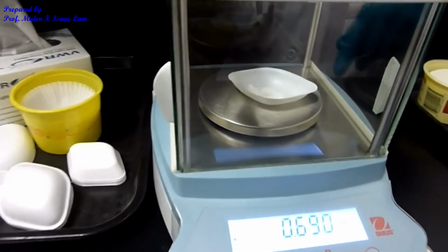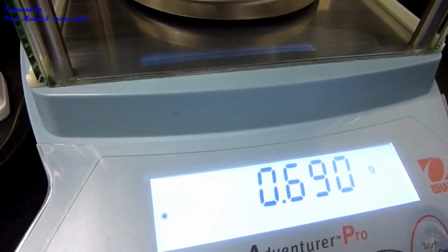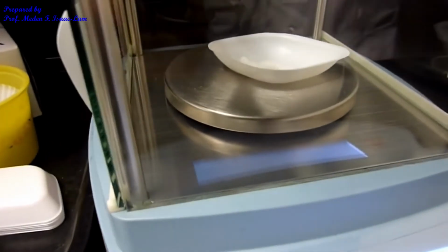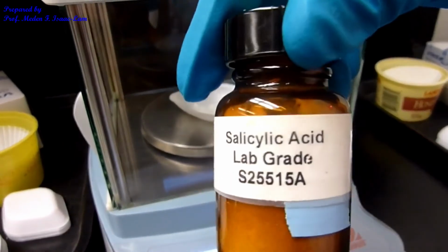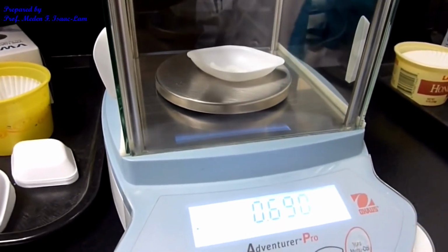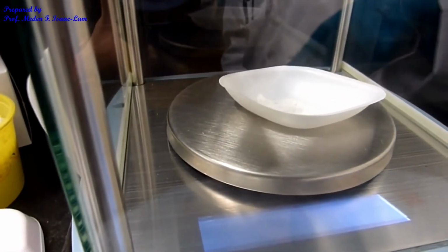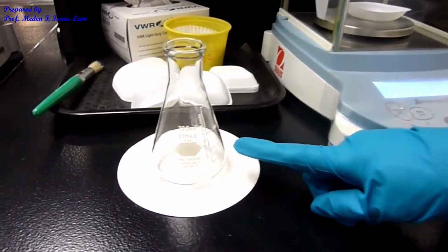So I already weighed 690 milligrams or 0.690 grams of salicylic acid inside the balance, and this is that sample, salicylic acid lab grade. So again, the weight is 0.690 grams or 690 milligrams. And then I'm going to transfer the sample into the flask, a 125 ml e-flask in here.